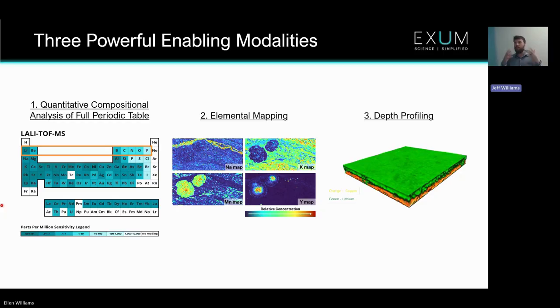This is one of the classic examples that we do in the industry space, and it's in batteries. So, reconstructing the chemistry of an anode. What you're actually looking at here is an anode where the green is the lithium and the orange is the copper. And not only were we able to look at the distribution of lithium in space here, of where's the lithium, but what contaminants were there? What did the SEI layer look like?